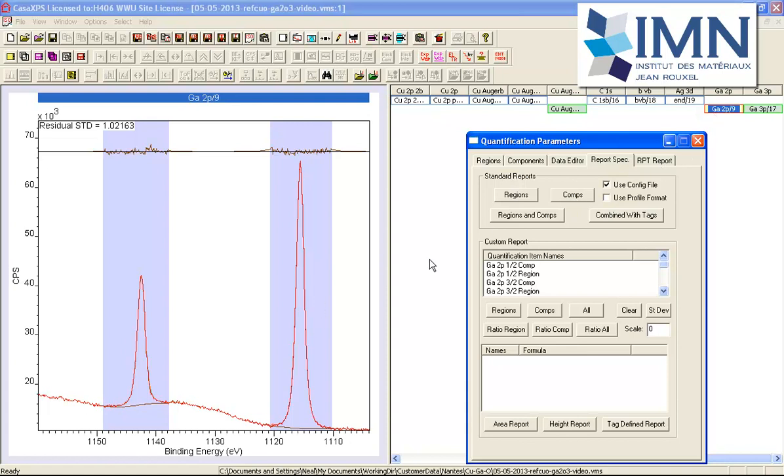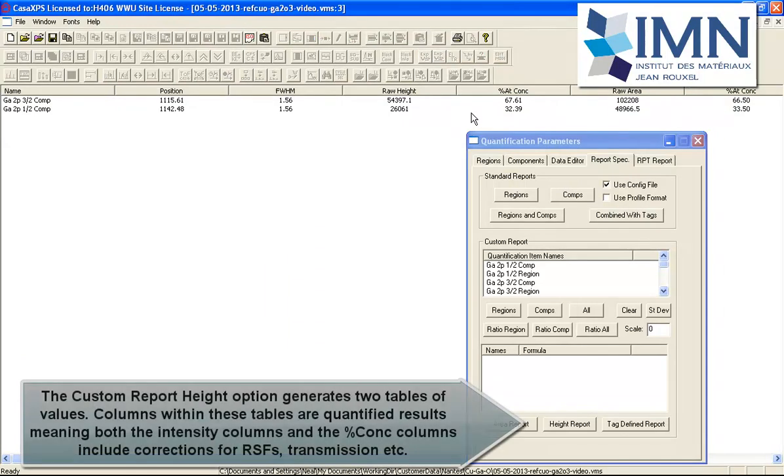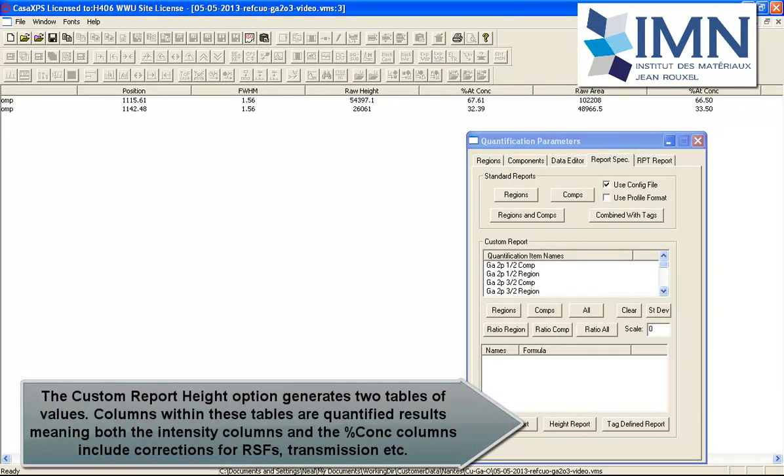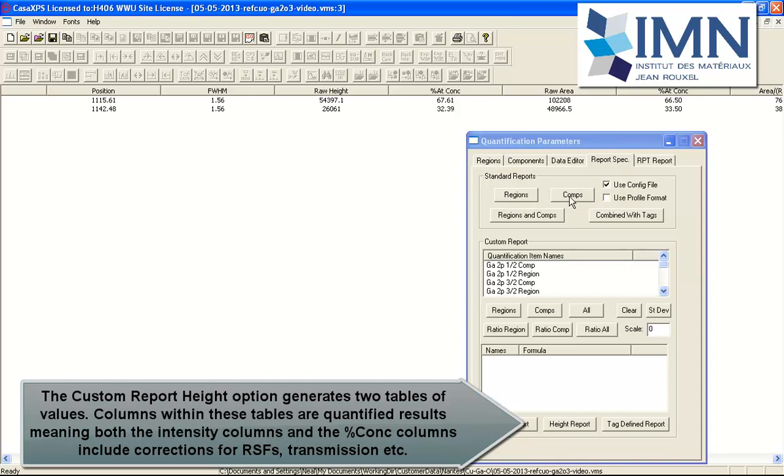Now the report spec page, using the same configuration file applied to these gallium components as opposed to the regions, again you can see that the height has produced very similar result in terms of the atomic concentration based on height to the area. The reason for that is the full width half maximum is the same. Nevertheless, you can see that the regions and the components from these gallium 2p, when you have uncorrelated doublet peaks, you can produce the same results from regions or components using the standard report and different configuration files.